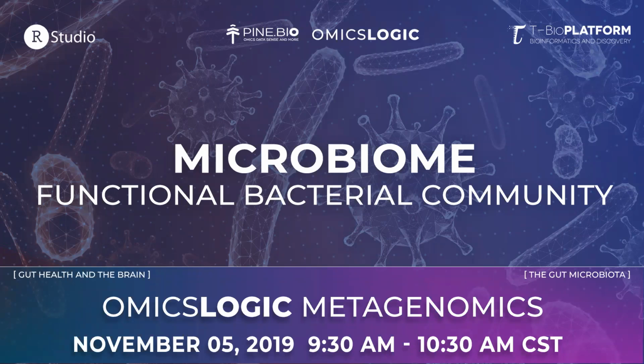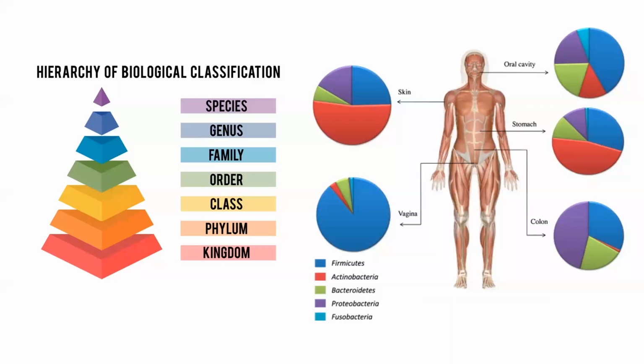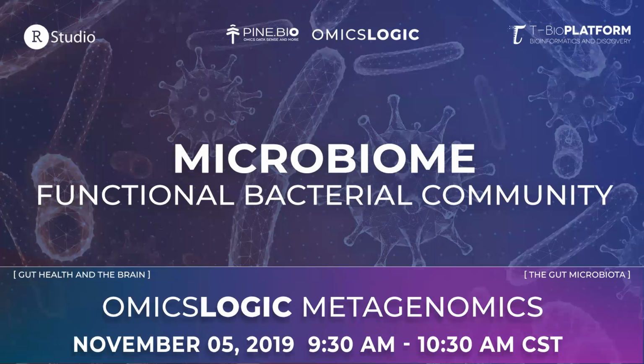When we look at these different types of microbiomes, we'll talk about how these considerations about what we are sequencing and how we are sequencing will ultimately dictate how we're going to be able to analyze the data.